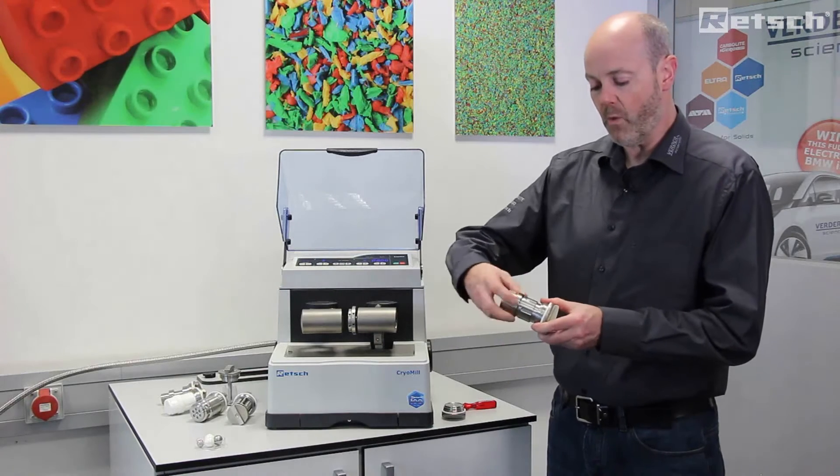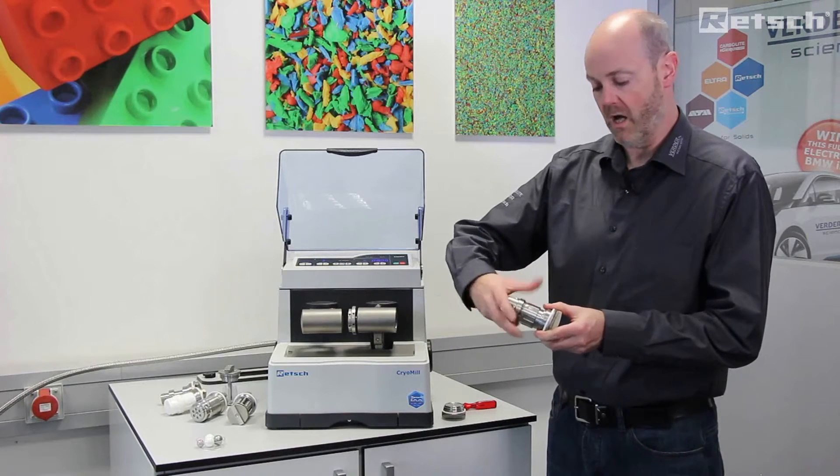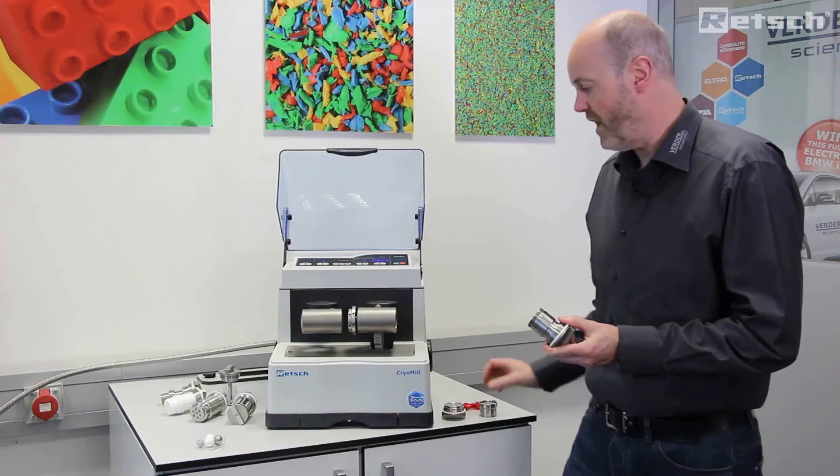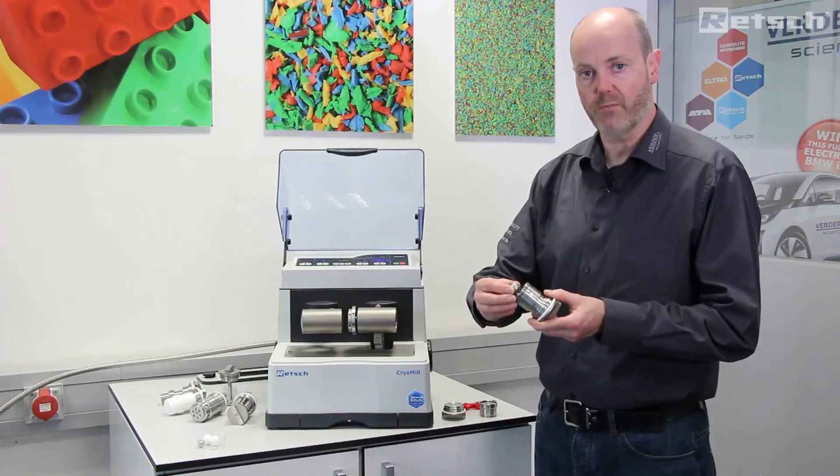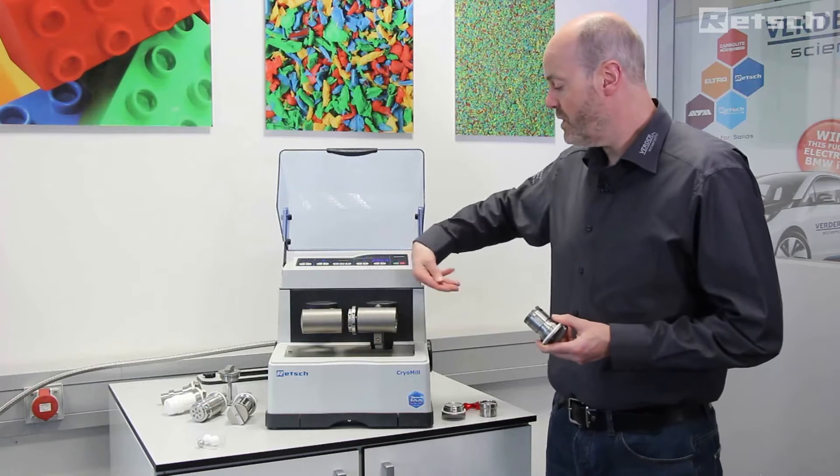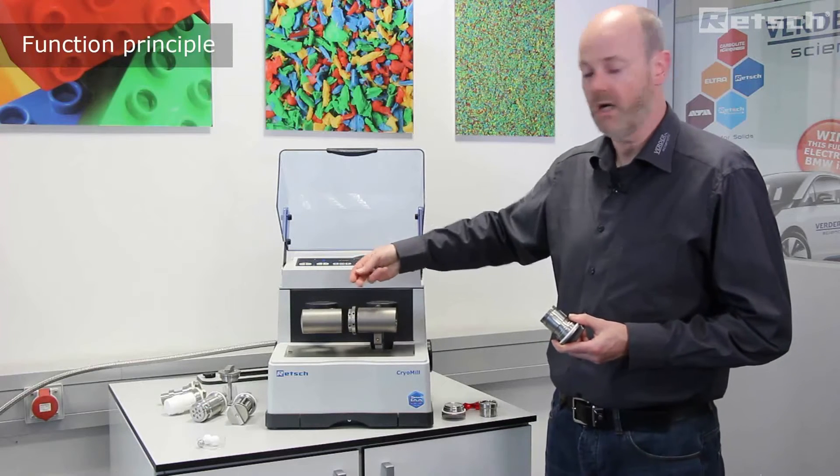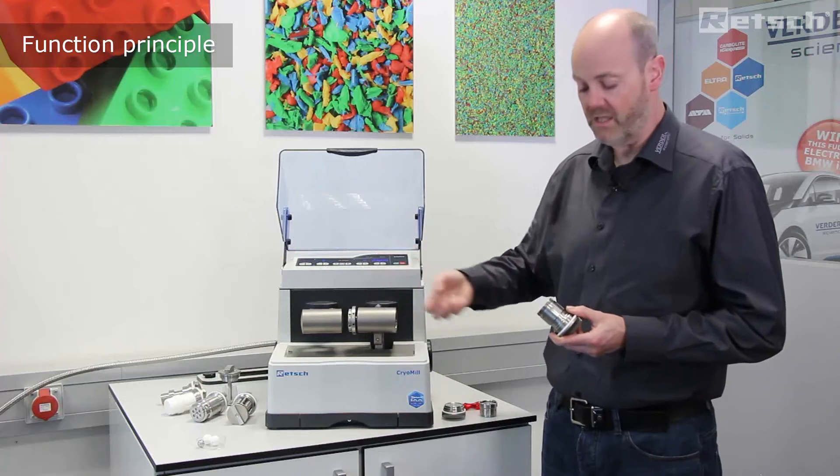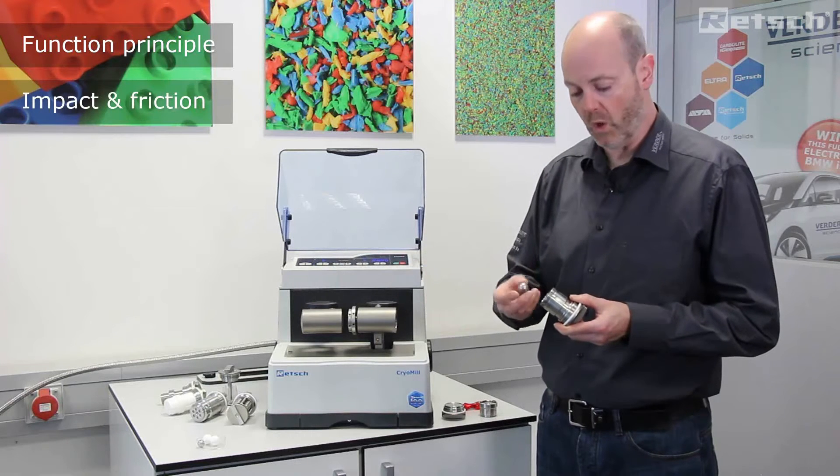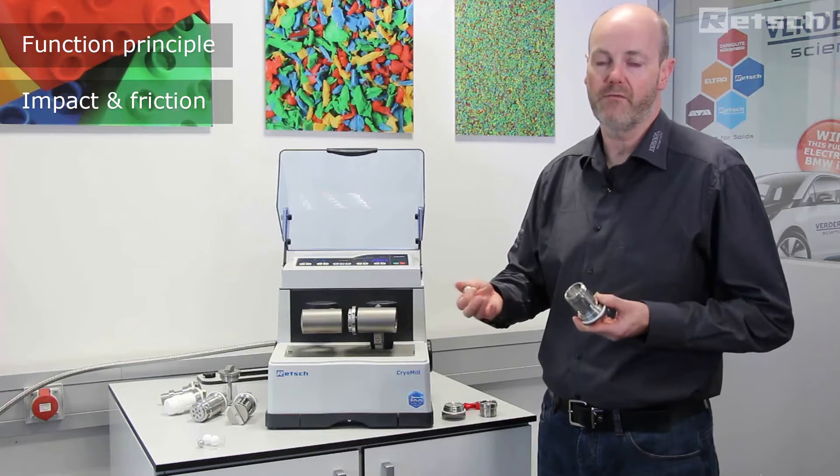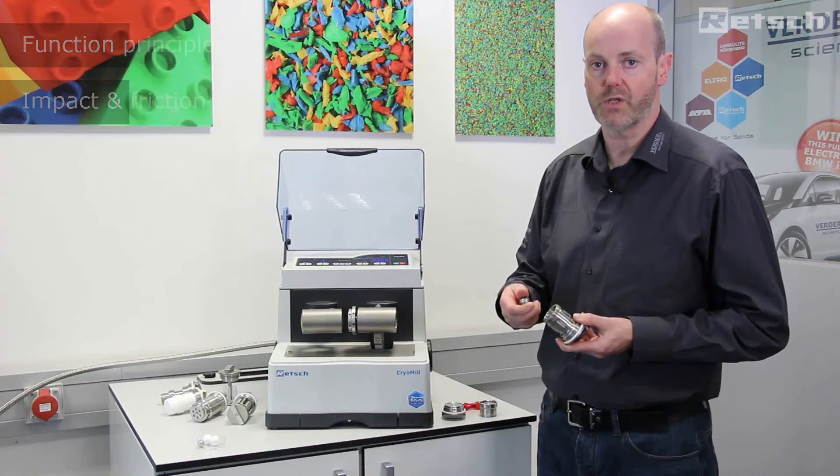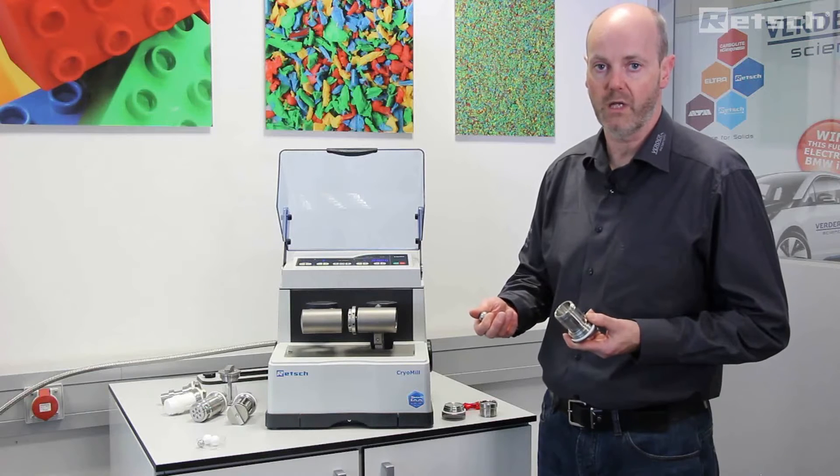We have a grinding jar of various sizes and various materials, and inside we have a grinding ball. The instrument oscillates from side to side at the preset amplitude, and it is the repeated impaction of the ball against the rounded inside surfaces of the jar that facilitates particle size reduction.